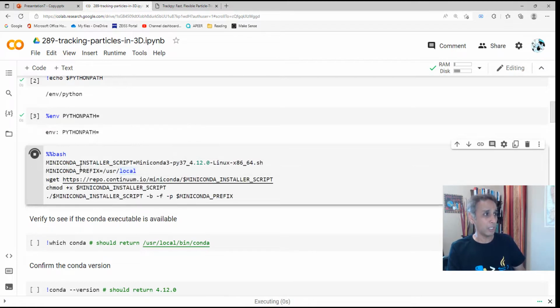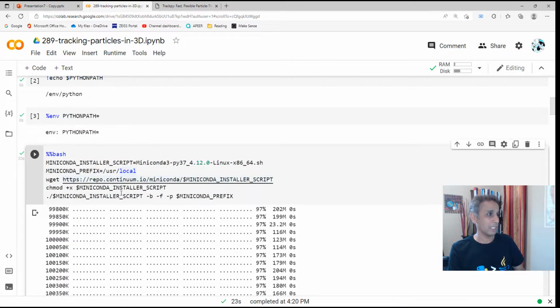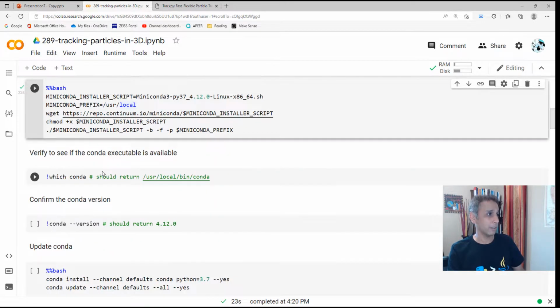So now I'm going to install the Conda environment, and as you probably know, Conda comes with a few packages already installed, and one of course is Python, but in addition to that it comes with basic ones like the core essential packages. On top of that you can install any of the others, which is exactly what we'll be doing in a few minutes anyway. So once this is done, I am going to kill the output. I don't care about it.